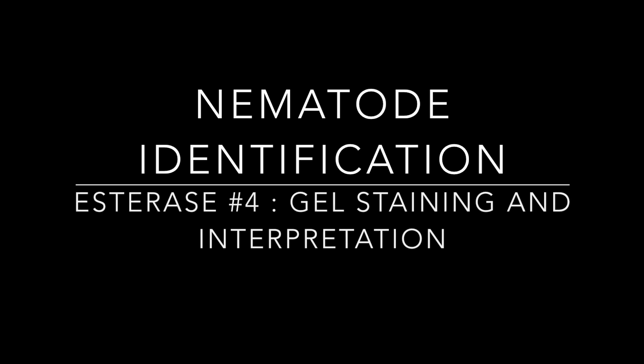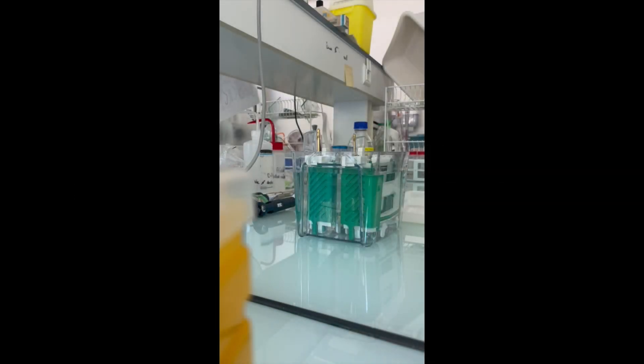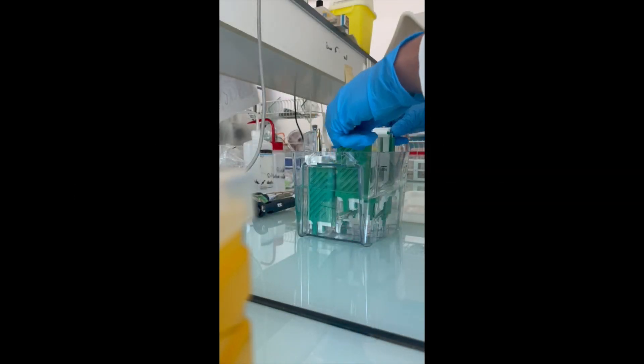Hello and welcome to this video series related to the molecular identification of nematodes by the esterase method. In this final episode, we will see how to stain the gels and interpret the esterase profile of the different root-knot nematode species.